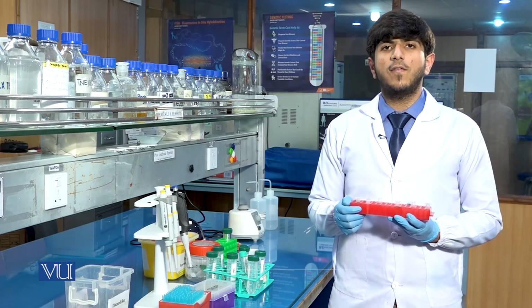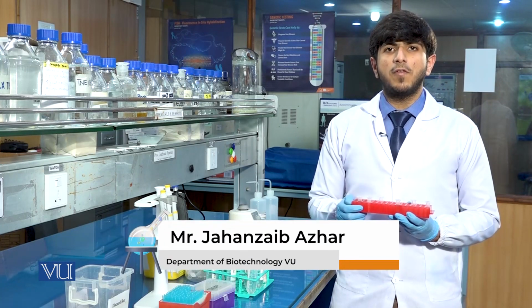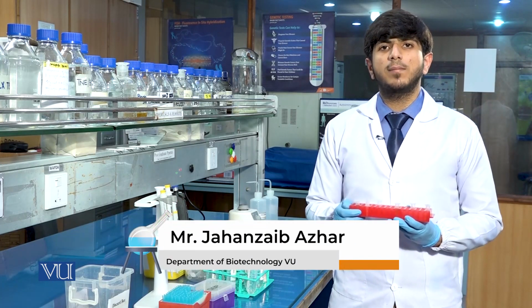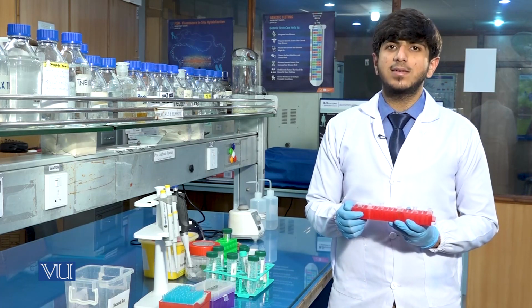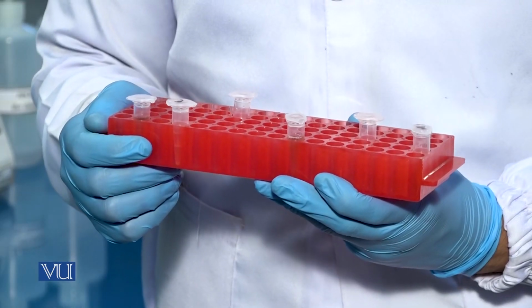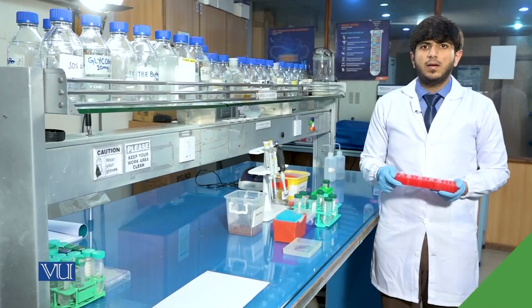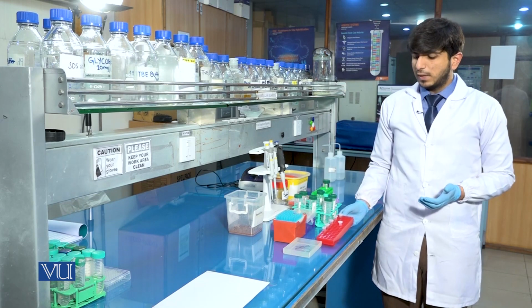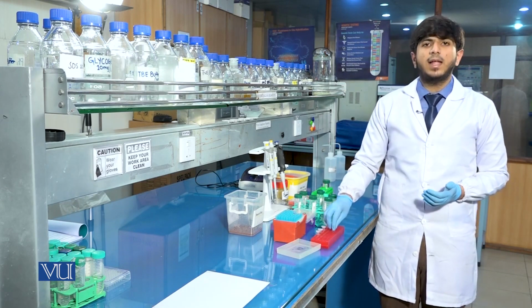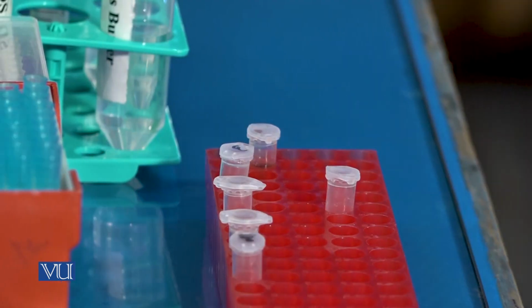After the addition of ice chilled ethanol, we will again centrifuge the sample at 8000 RPM for 7 minutes at 4 degrees Celsius. After the centrifugation, we will discard the supernatant and then air dry the pellet.